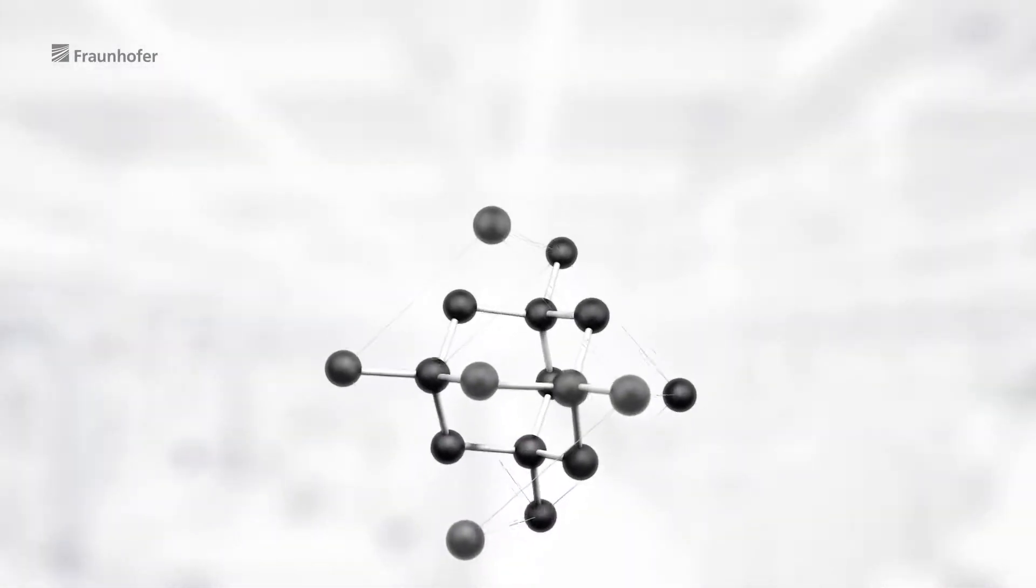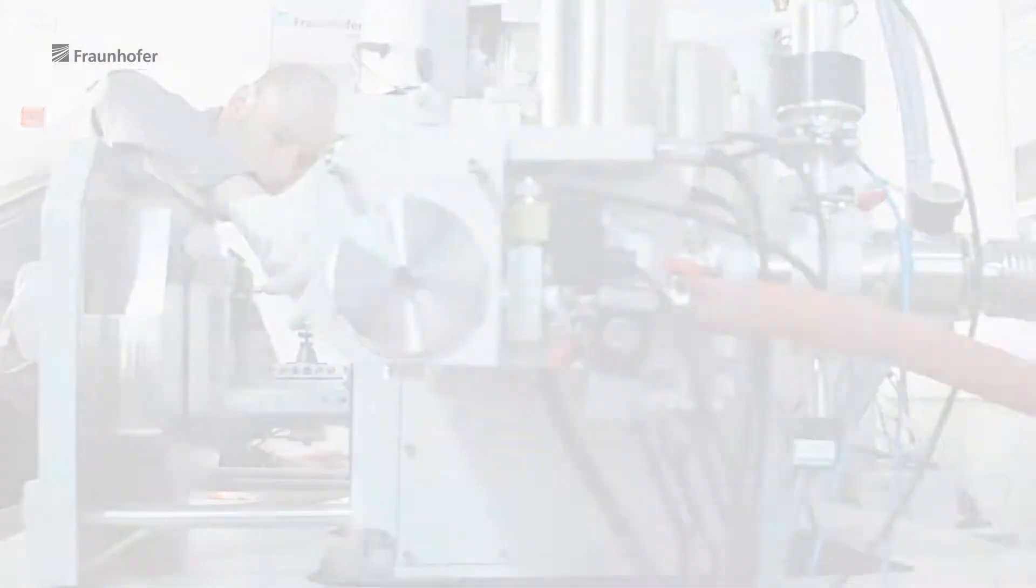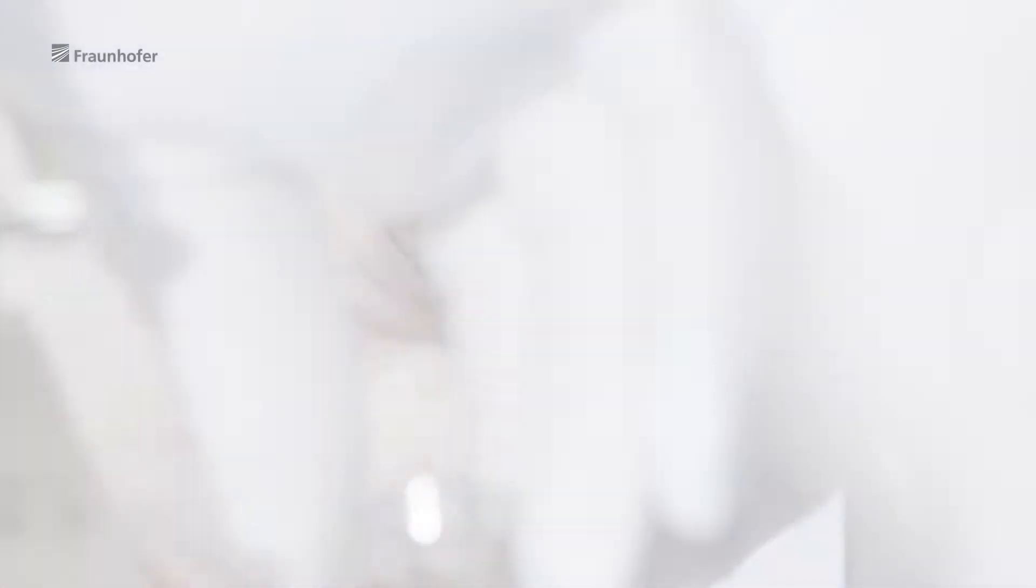We can only achieve sustainable solutions if we penetrate right into the very heart of things and consider the materials down to their smallest components. At the Fraunhofer Institute for Microstructure of Materials and Systems in Halle, we investigate the detailed makeup of these materials.